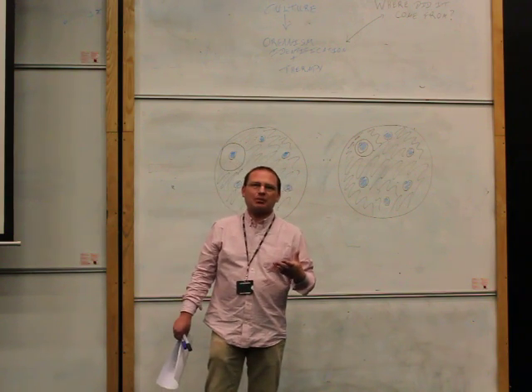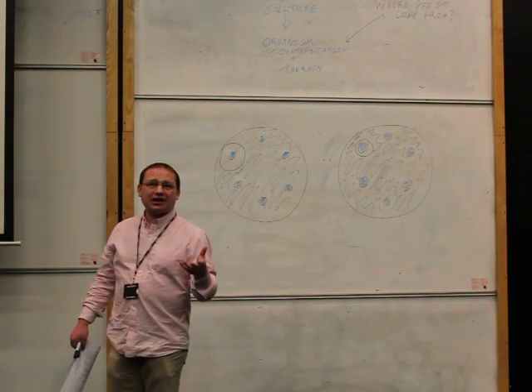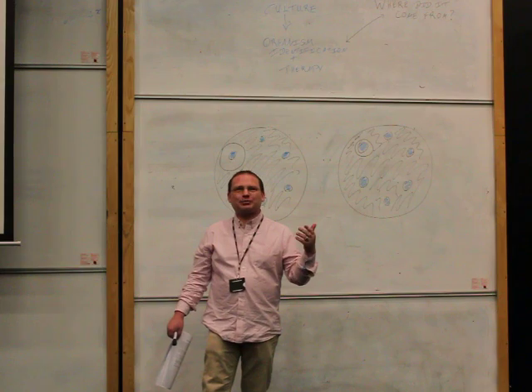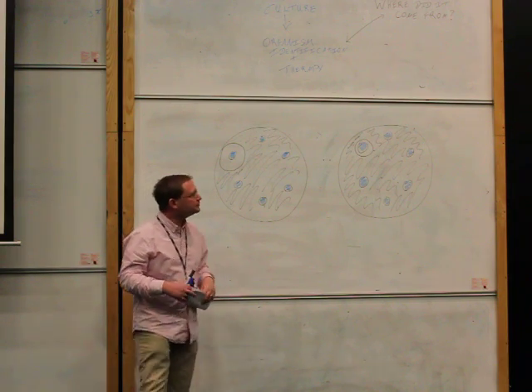So you may have to do a little bit of maths to ensure that you've got the same zone sizes as everybody else. Basically, you have to scale up or scale down depending on the size of the picture. But any questions, please do ask.